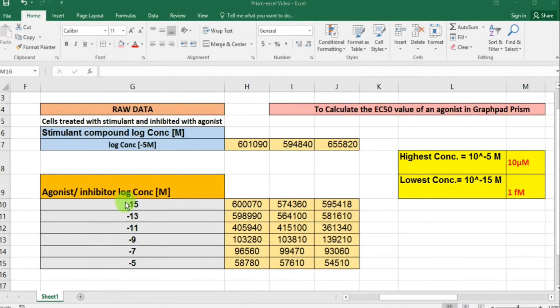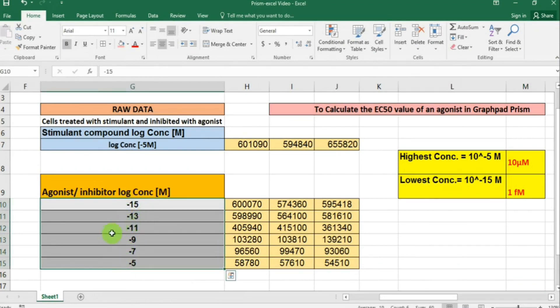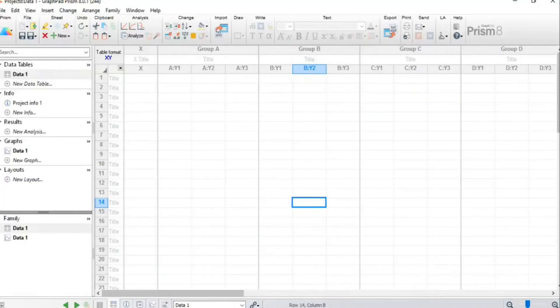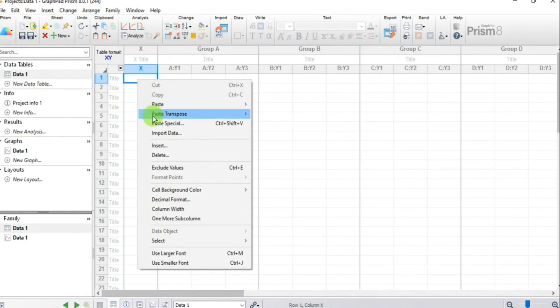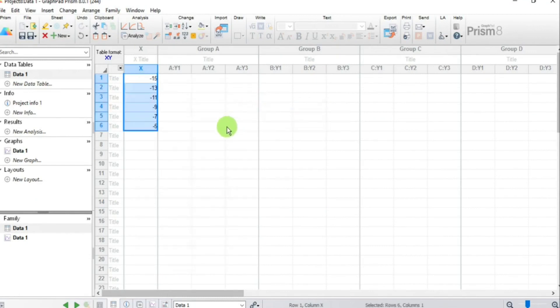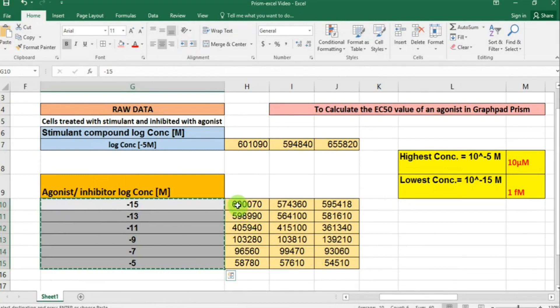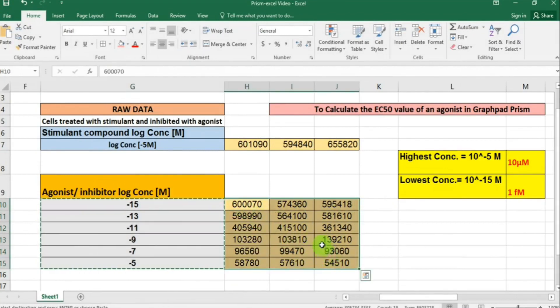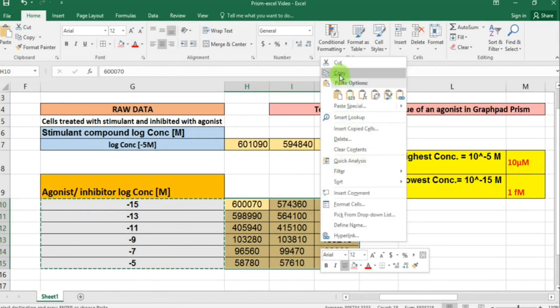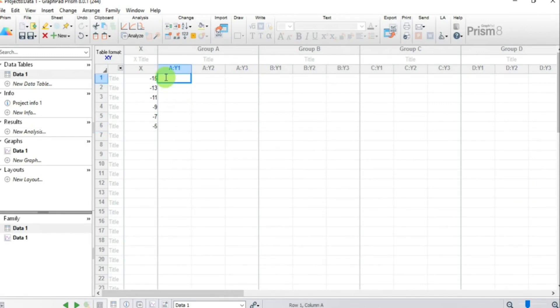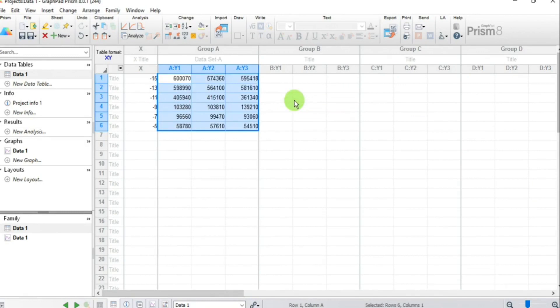Let's copy our X values — the log concentrations — from the Excel sheet, then open the Prism file, right-click, and paste the data. Our X values are now arranged in the X column. Now let's go back to Excel and copy the response values.